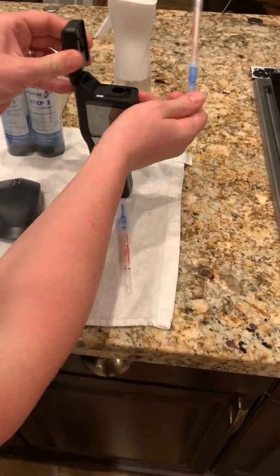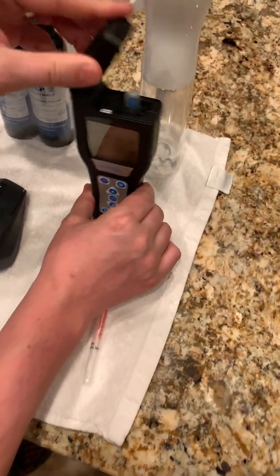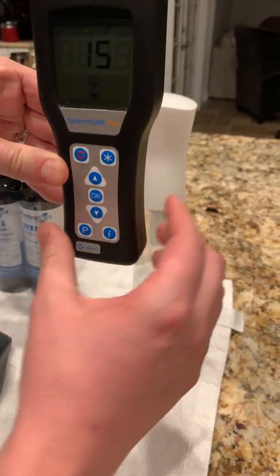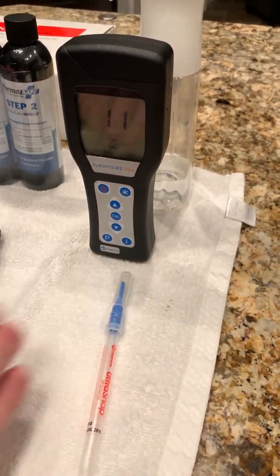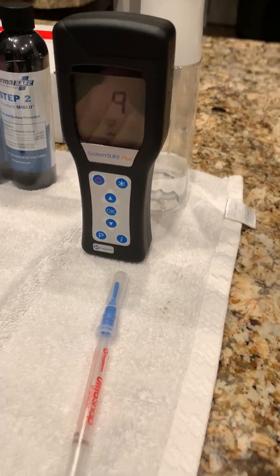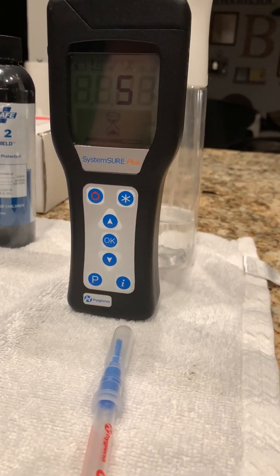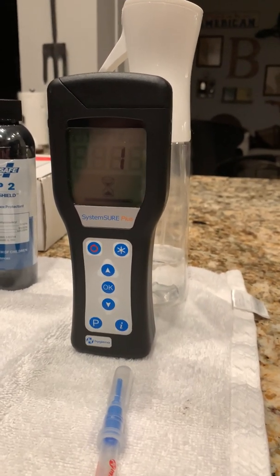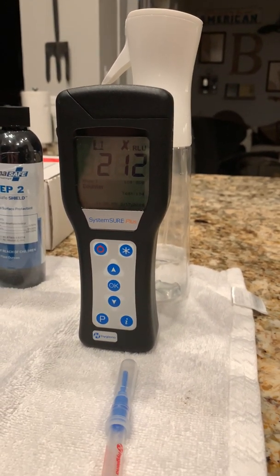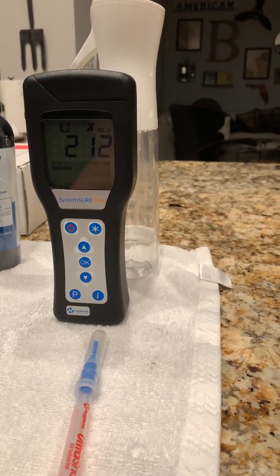I'm going to open up the lid, drop the swab into the slot, and close the lid. Now I'm going to press OK. You want to make sure that the device stays perfectly vertical, so I'm going to set it down on the counter. It does a 15 second countdown and then gives you a measurement in relative light units. There are 212 relative light units of ATP on this particular surface.